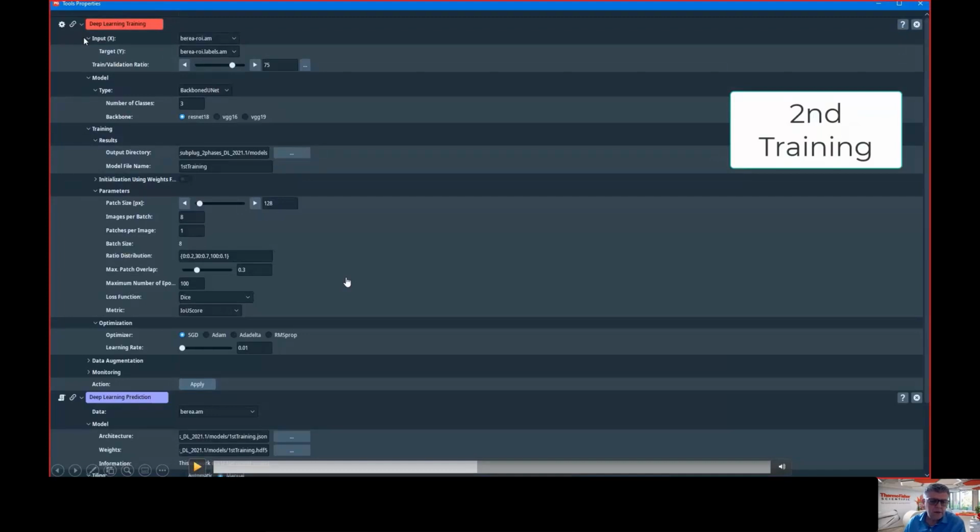Another important detail in deep learning: to do the training, you need a very good machine, a lot of GPU memory. To do the prediction, it's not needed. So you could have one very powerful machine where you do your training, and then once you have saved this file, the model, you can do prediction on another machine with these models, and the other machine doesn't need to be a super duper machine.